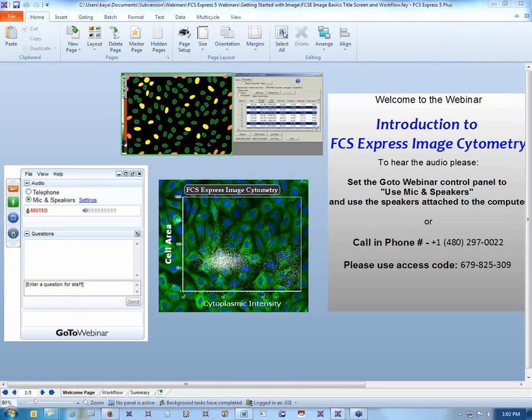So the main principles of flow cytometry and image cytometry overlap, such as taking multi-channel fluorescence data and plotting the data in scatter plots and histograms to look for statistically significant differences and changes. With FCS Express Image, you can now take your image cytometry data a step further and leverage the most powerful tools in our flow cytometry toolbox to analyze your multi-parametric data sets.